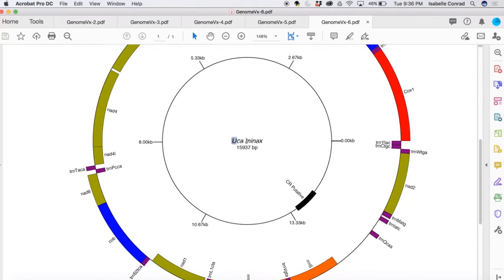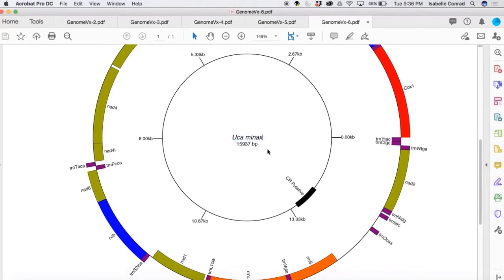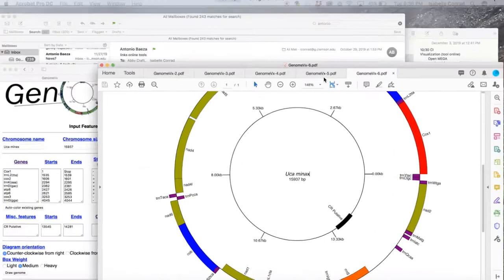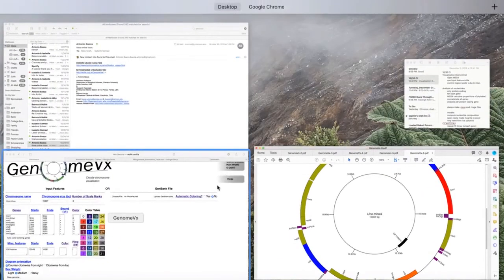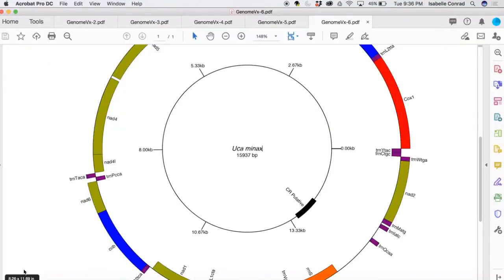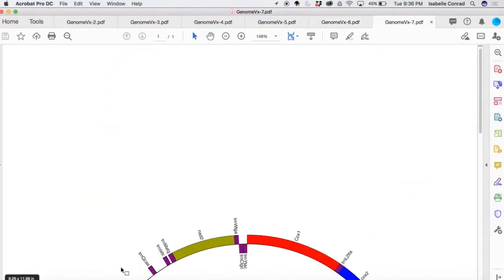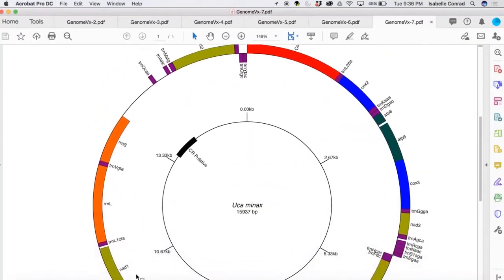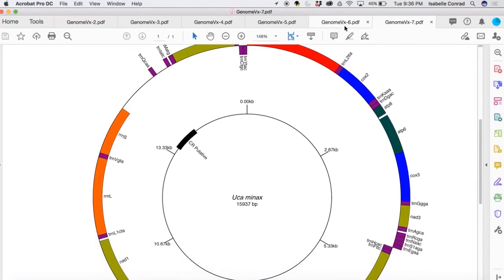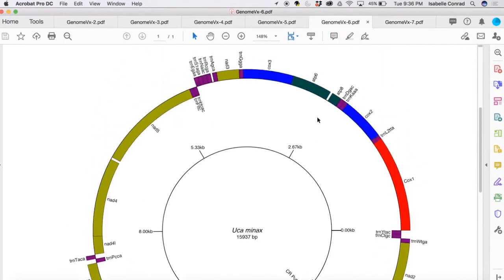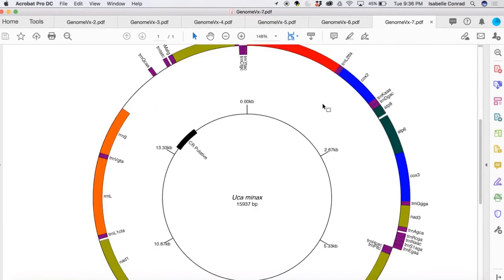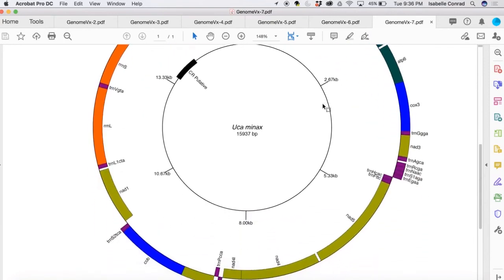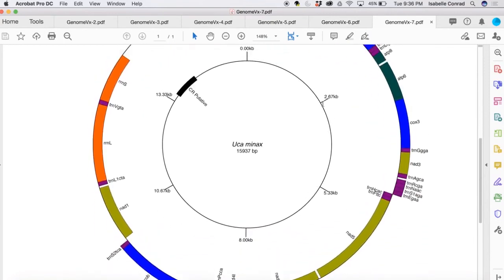So you can also go in and change the way it looks depending on your preferences. So we're going to go do that. You can go to diagram orientation and just change the way that the genes go either counterclockwise or clockwise. So here is a clockwise version. We were looking at a counterclockwise version. There it is the original versus the clockwise version. So it's just preference.